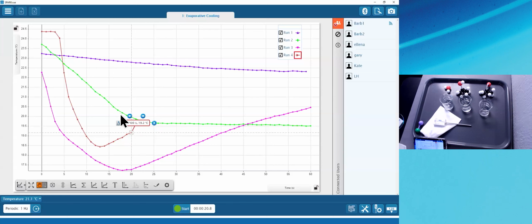points. The little buttons around the XY bubble go away, but if I click it, I can get them back, no problem. Once I get them back, I can hit the arrow button to go left or right, to get one point at a time. I can get rid of it by touching it and hitting the X. So that is the coordinate tool. I can either get that by touching a data point and turning on the coordinate tool, or I can go to the menu down below here and click coordinate tool.